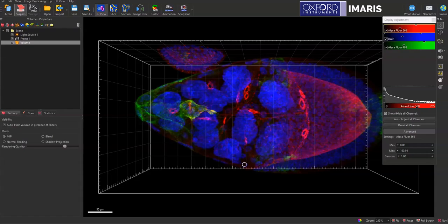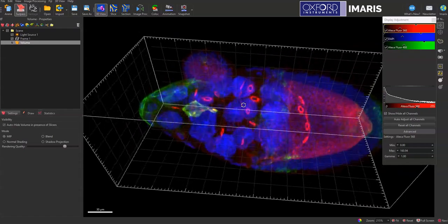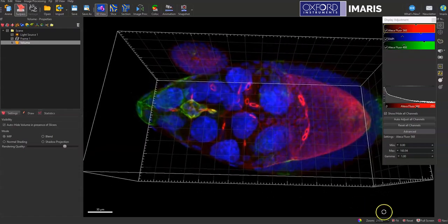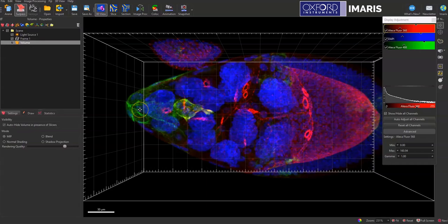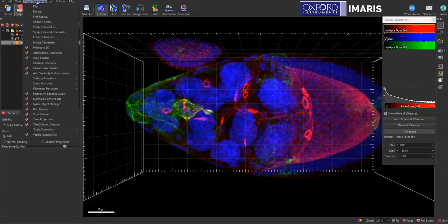So the first thing you can see here is that I have a 3D image and what I need to do to turn this into a mock time lapse so I can separate those different Z planes is to go to image processing and then select swap time and Z.